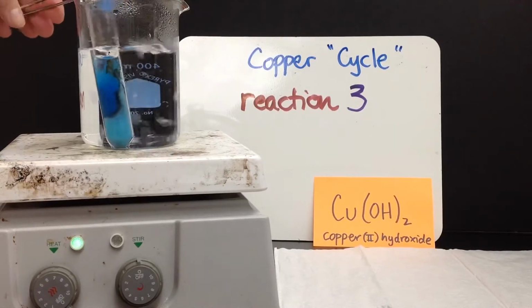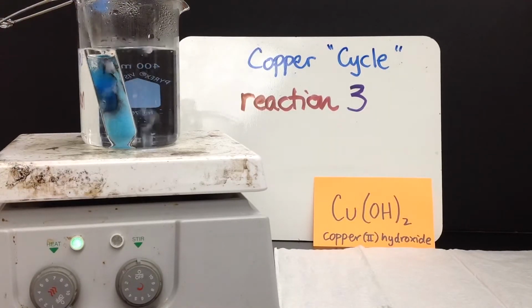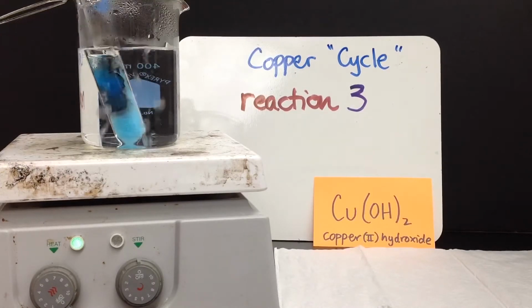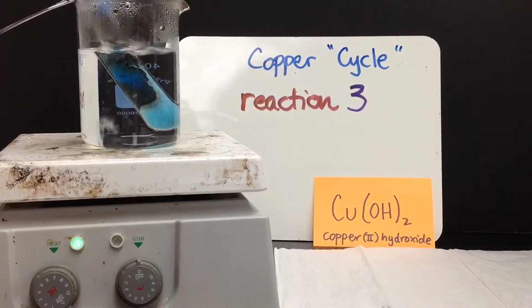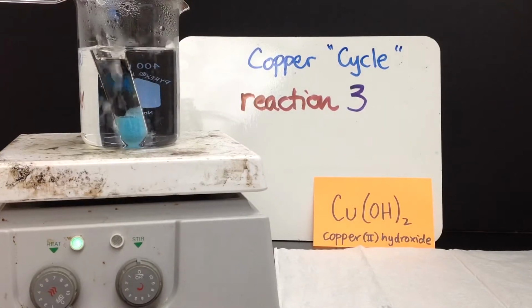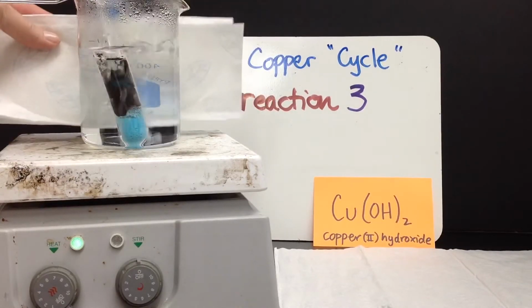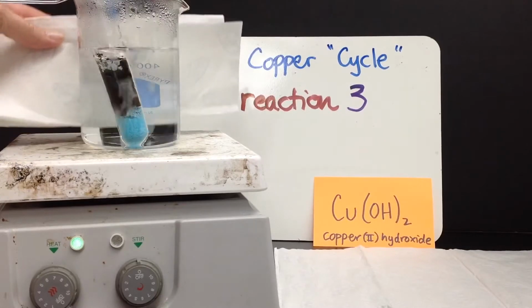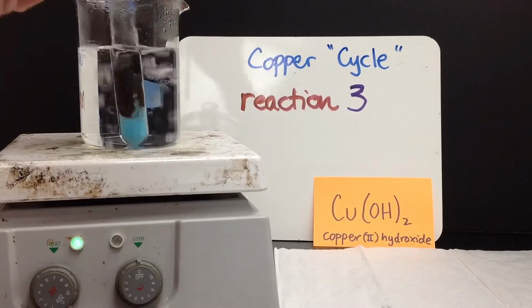So the question is, are we making any observations yet about the whitish blue glop that was the copper hydroxide, which is sitting in a solution which is blue? And I'm hoping we can start seeing some of this change here, because there's actually quite a... Let me get some white behind that so that we can see the substantial change. There, so there's a paper towel. That is not white, that is not blue, that has got this deep brown stuff. So now I'm going to actually stir that one up, and let's see what happens.